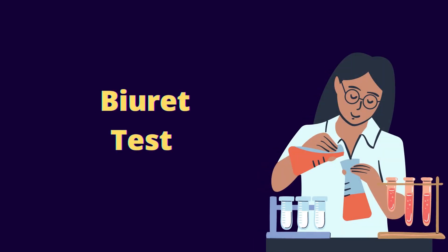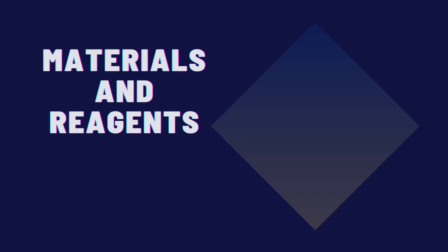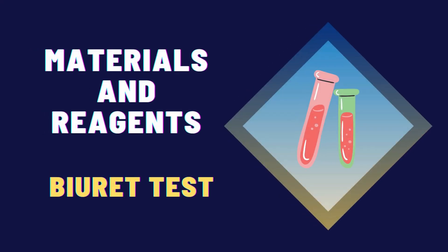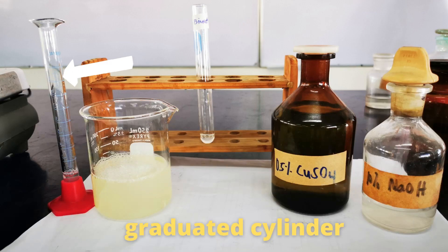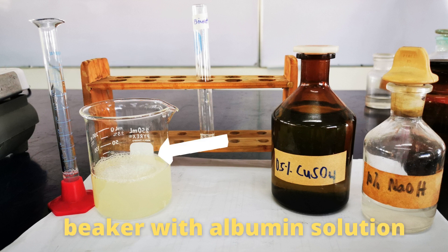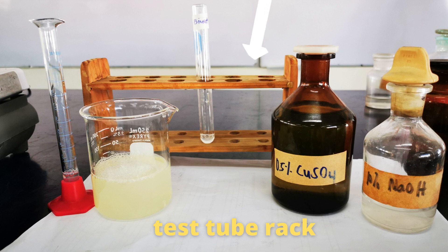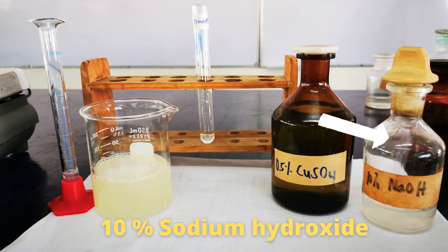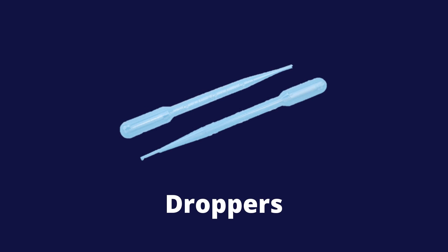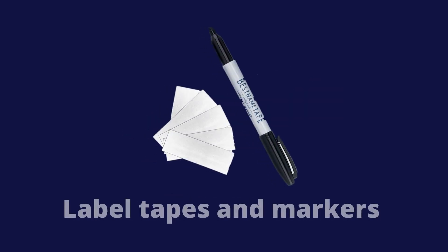Next, we have the biuret test. These are the materials and reagents for the biuret test: graduated cylinder, beaker with albumin solution, test tube, test tube rack, 0.5% copper sulfate, 10% sodium hydroxide, droppers, and label tapes and markers.